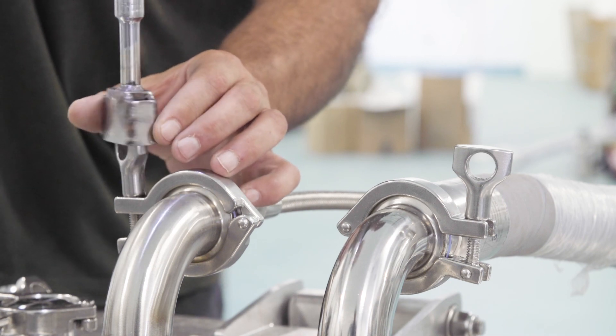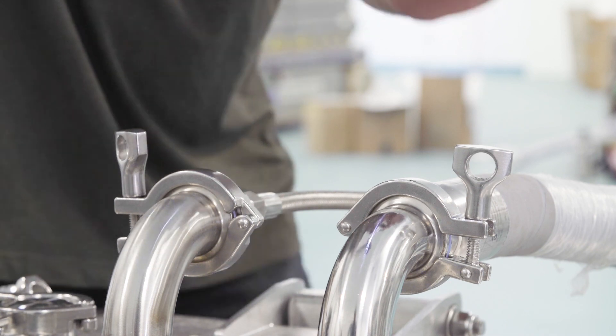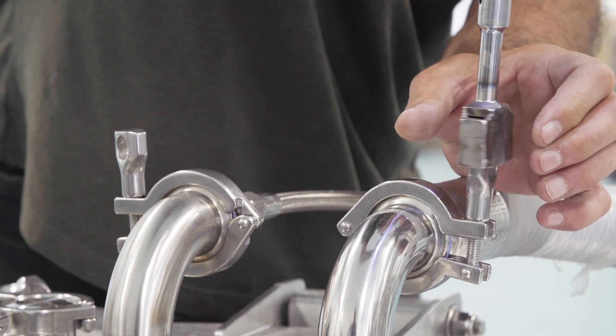Lastly, do another walkthrough of the entire system, tightening all tri-clamps to prevent leaks.